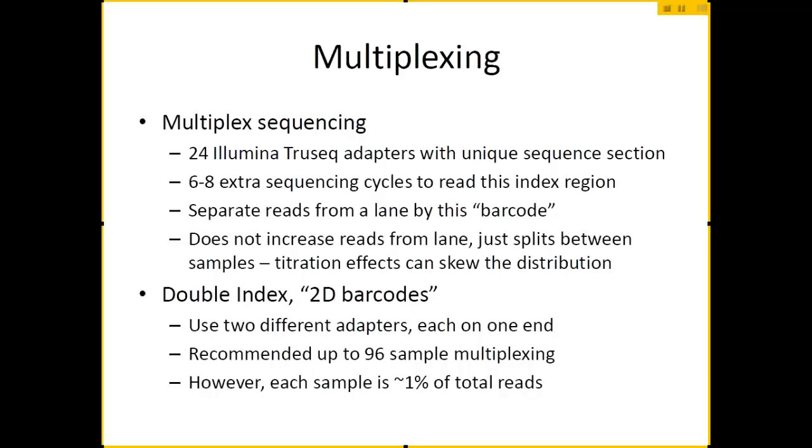Sometimes these adapters share the same base pair at a particular position in that 6-to-8 base pair barcode. For that reason, I now recommend that if you're going to multiplex, you should always multiplex at least four samples at a time. We had problems where people were multiplexing only two samples per lane — the actual reads looked great, but the machine was confused during the indexing step and I could not resolve them into their two appropriate pools.